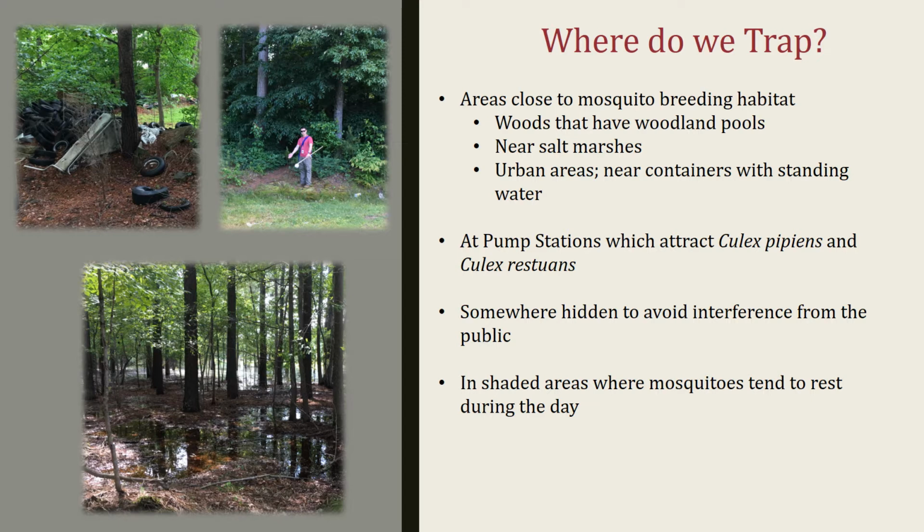We can also trap at pump stations, which attract Culex pipiens and Culex restuans. You can trap somewhere hidden to avoid interference from the public. You can see our intern in the top right here showing a little trail we have to one of our trap sites, but it's fairly covered, you can't really see the trap. And also in shaded areas where mosquitoes tend to rest during the day.